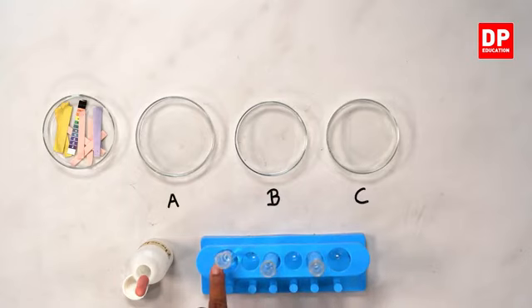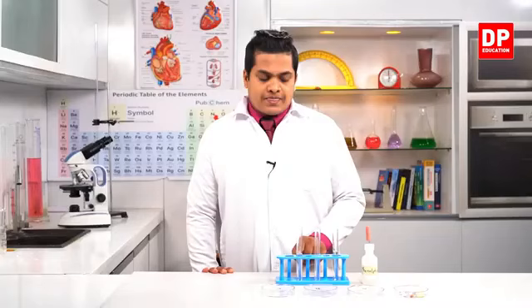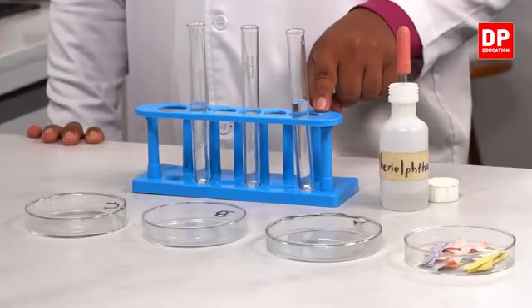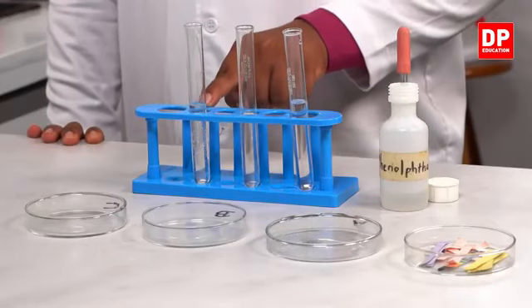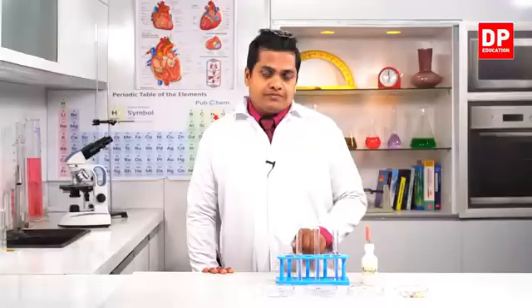C, sodium chloride solution, common salt solution. Once again, A, HCl, B, sodium hydroxide, C, sodium chloride or common salt.